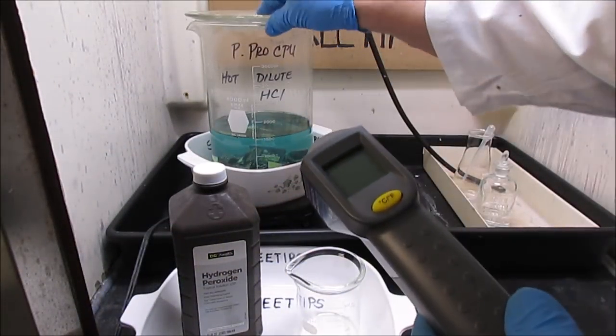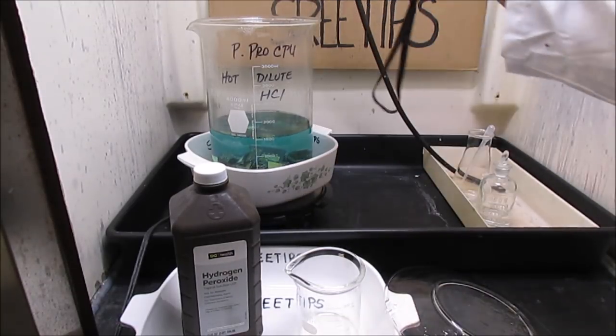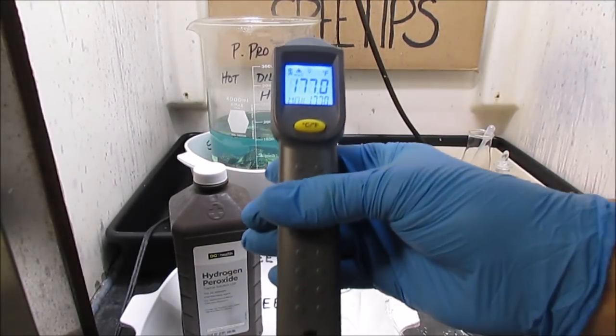It's been about 15 minutes since I added that last dose of hydrochloric acid. I'm just going to get a quick reading on our solution here. It's at 177 degrees.